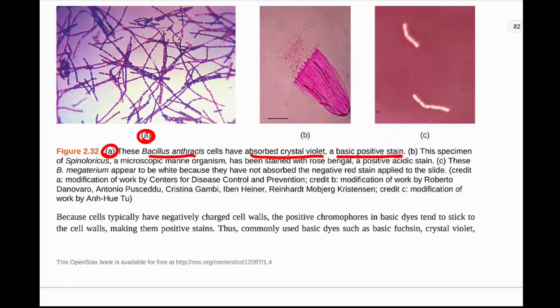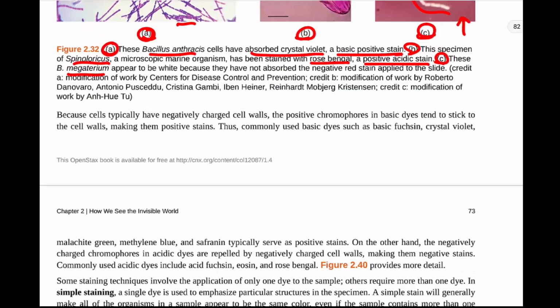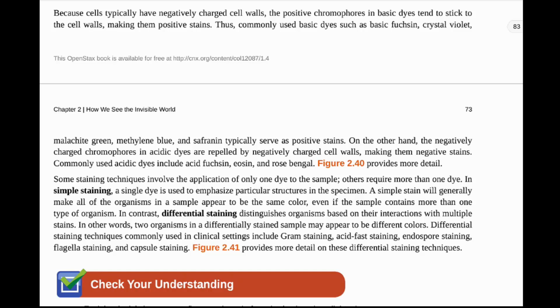We can scroll up here and take a look at these. Here, like we said in A, Bacillus anthracis have absorbed the crystal violet, which is a basic positive stain. In B, this specimen, Spinoloricus, a microscopic marine organism, has been stained with rose bengal, which is a positive acidic stain. So this one's acidic and that one's positive. And in C, the B. megaterium appear to be white because they've not absorbed the negative red stain applied to the slide. In this case, the red stain is in the background, and the organism is not stained.